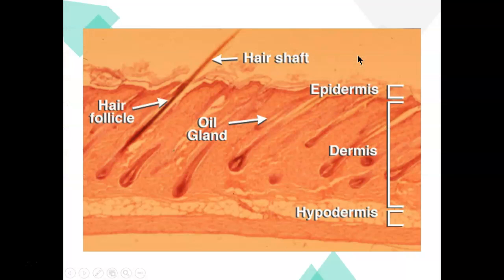All right. So in this image, you can see the layers of the skin with some of the accessory organs. So the outer layer here is the epidermis. Now it actually starts right about here where this dark layer is. You can see it very clearly if you look across here. All of that is epidermis and everything above it. So everything that is superficial is the epidermis.